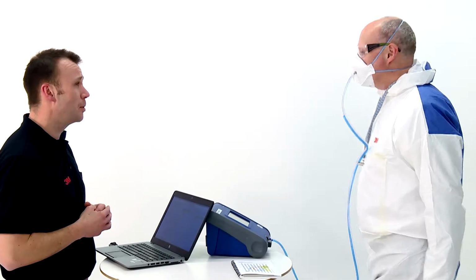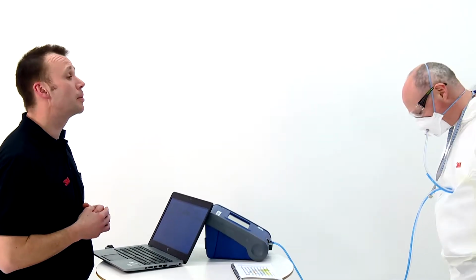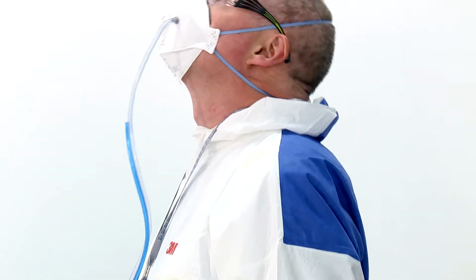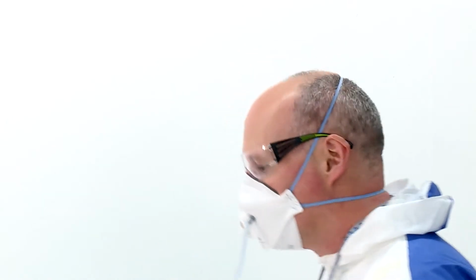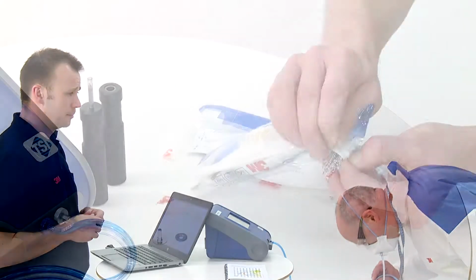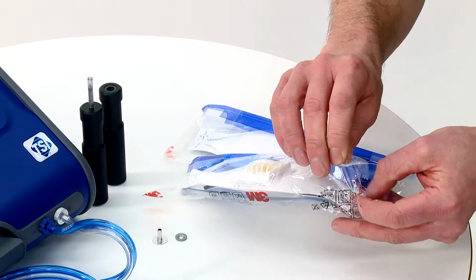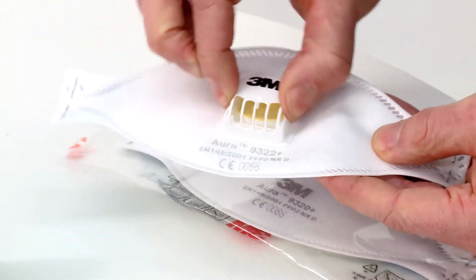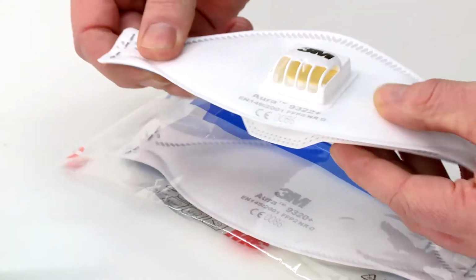For an accurate fit test, and without affecting the seal of the tight-fitting respirator to the face, air from within the breathing zone inside of the mask needs to be sampled. Preparing a tight-fitting respirator, or probing a respirator, is achieved in a number of different ways. Before fit testing a respirator, inspect the respirator for damage, integrity of parts, and presence of appropriate valves.